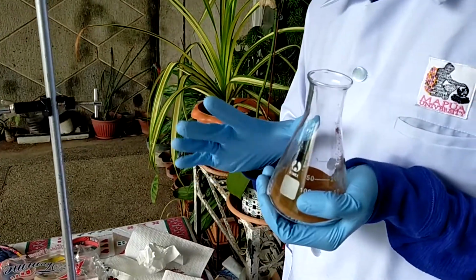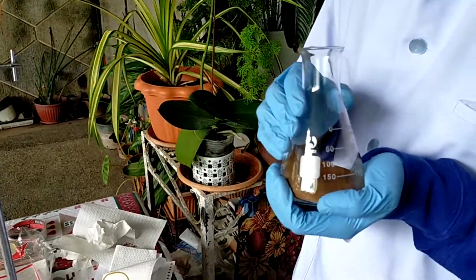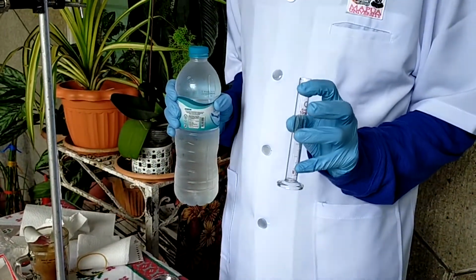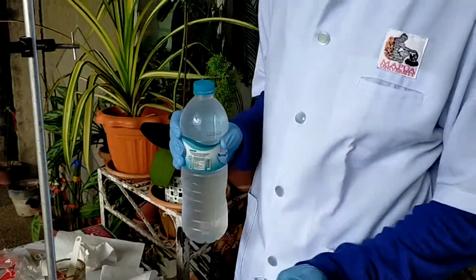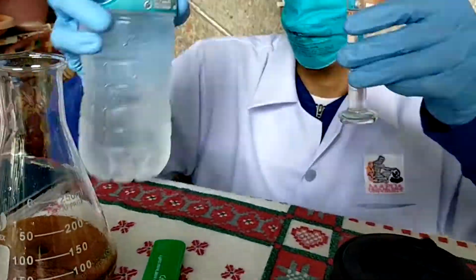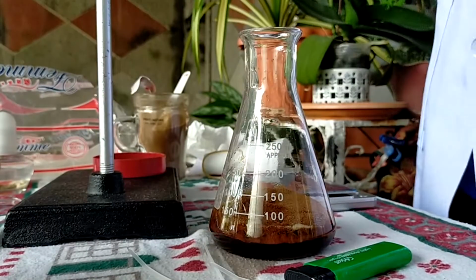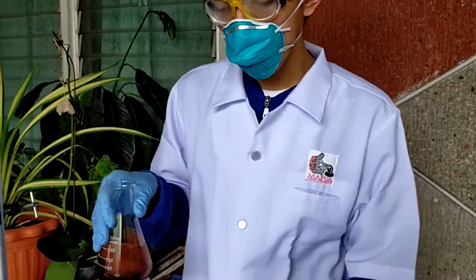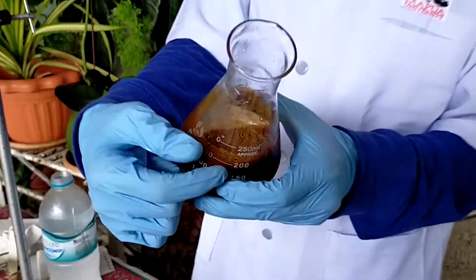Now I will add 70 mils of water in this flask. I will be using distilled water. This 10 ml graduated cylinder, I will make 7 measurements so that I will have 70 mils of water. This is my distilled water, and I will put it here. So it seems that my concoction of 15 grams of coffee and 70 mils of water is too few. There are still solid clumps of coffee here.